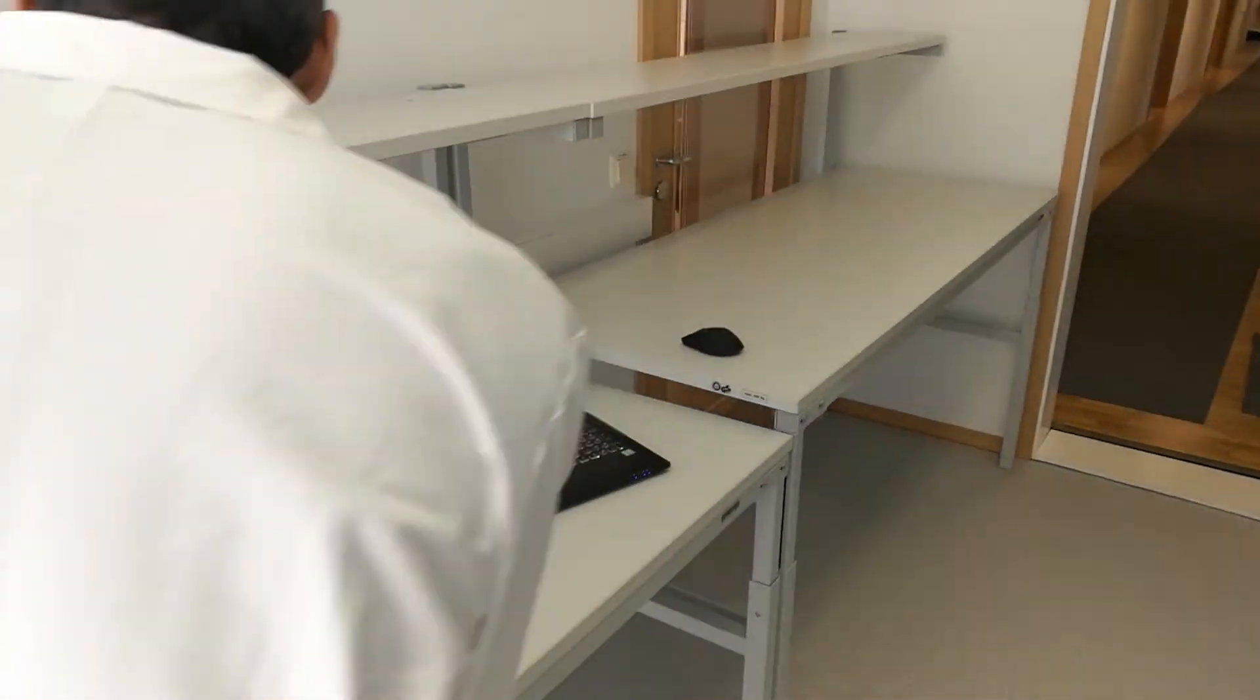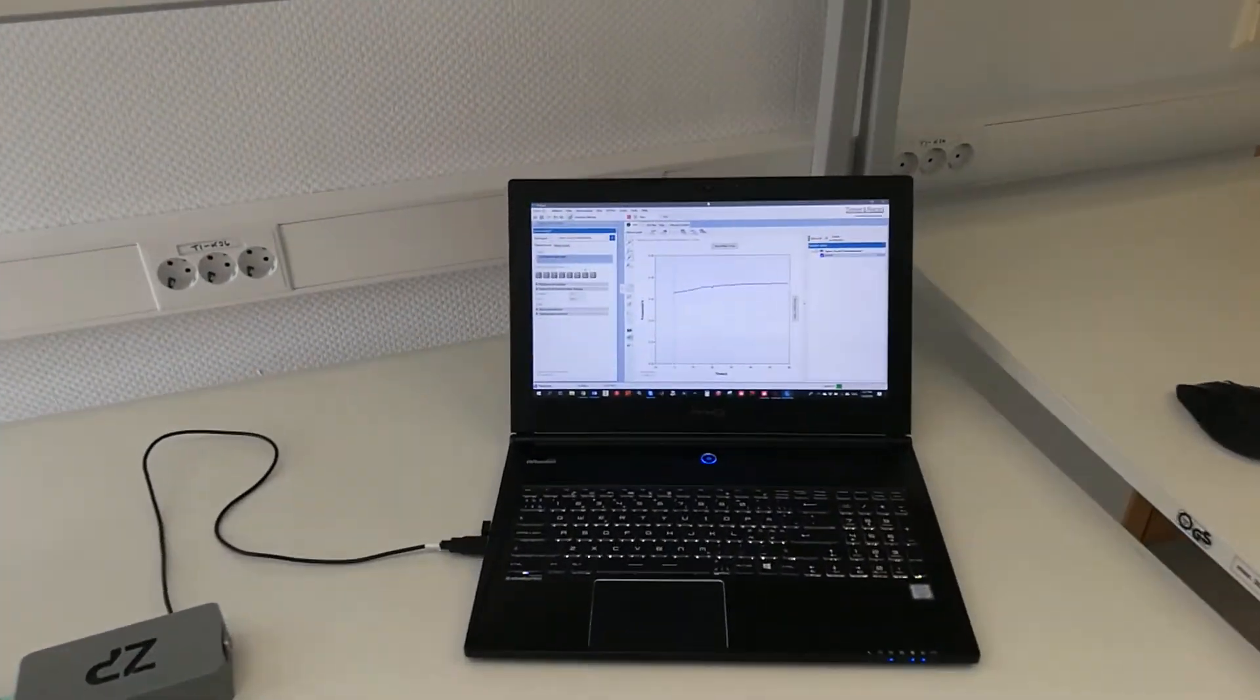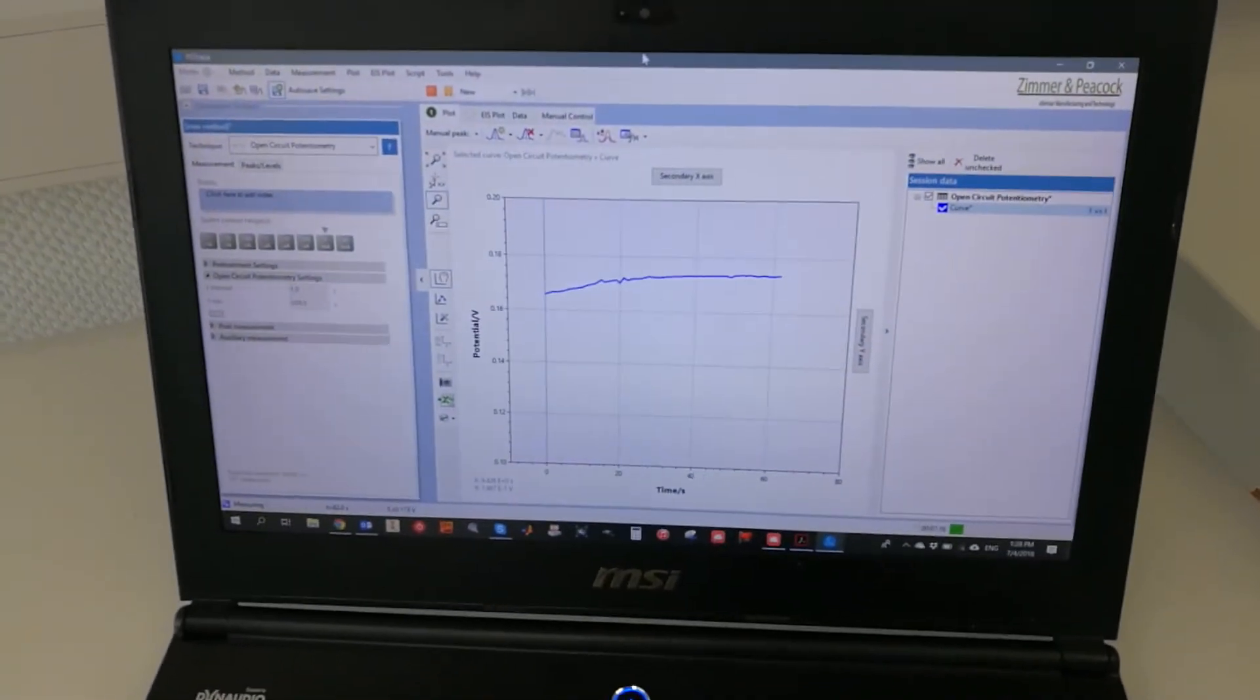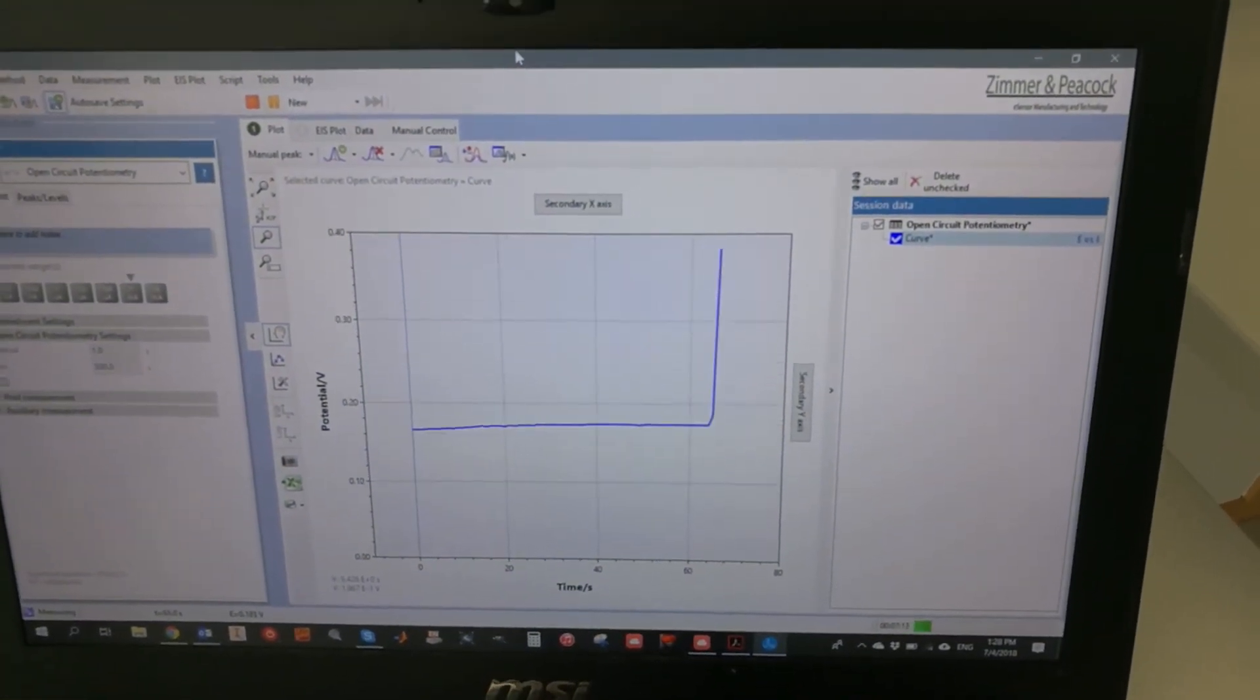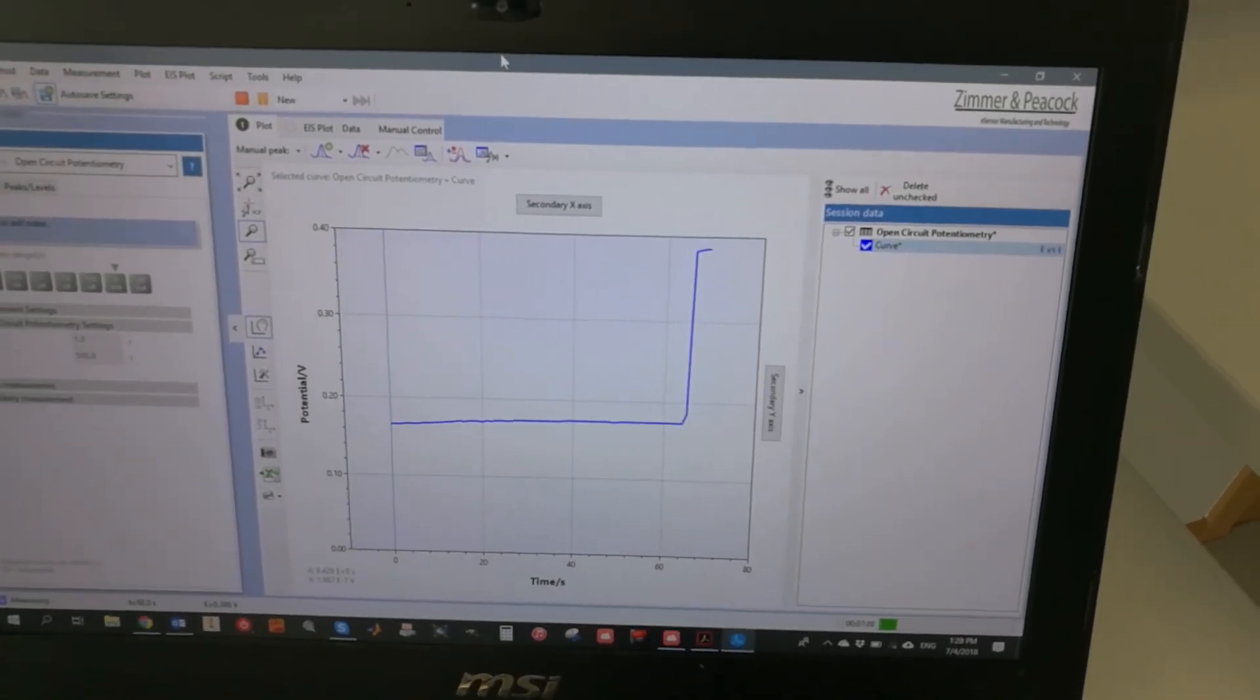If you look at the graph, you can see how it looks. Now I'm going to add this on top of the PBS solution. That's it, I added potassium. You can see the step there.